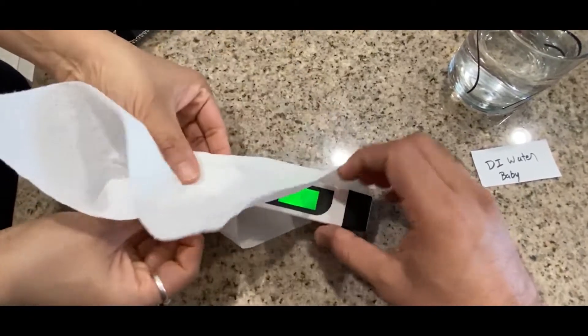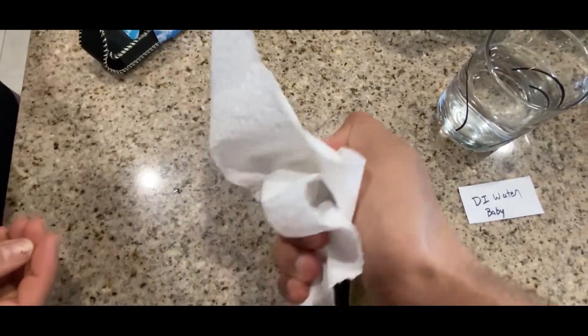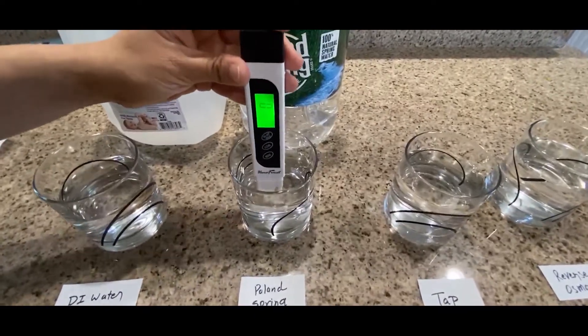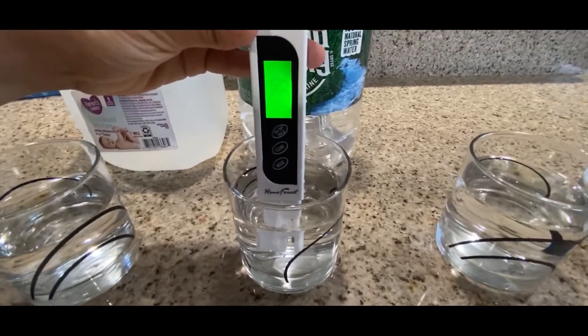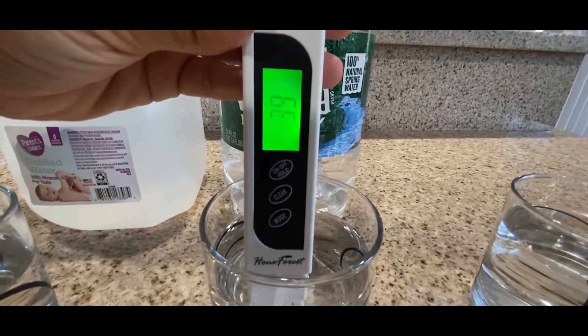I'm going to wipe the probe in between to make sure there's no residue going from one water to another. All right, so next is Poland Spring and the reading comes out to be 39.